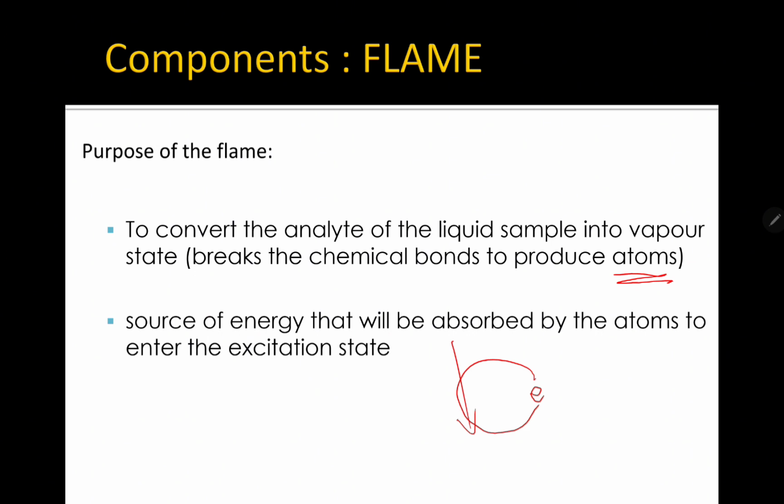Same lang gud na anang kanang pamakita nimo imong kanang the one, walang pasabi-sabi, guys, bigla na lang mabuang na lang jud ka, wala ka kabantay na excite na kagtaman, ingana siya. Same principle with the flame. Kaya nga guys, kung nakalaro kayo ng palatandaan ko dati dito, when we talk about flame emission spectrophotometry, I always remember yung flames good na friends, lovers, yung ganun, because halos it shares the same principle. Ma-love struck ka, ma-excite ka, and then hindi ka man always ma-excite, may time na mawala na siya, so you will lose energy, di ba, in the form of light, yung ganun siya.